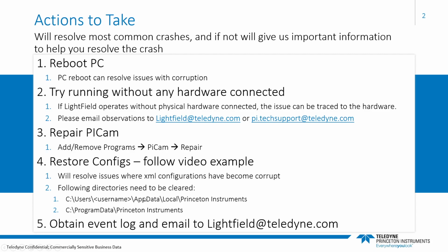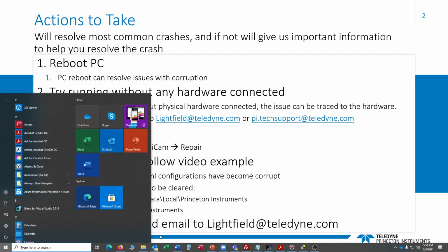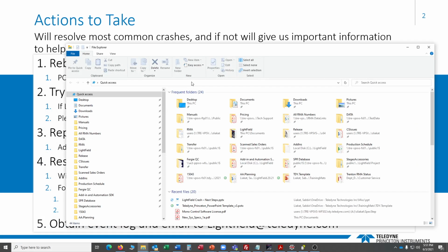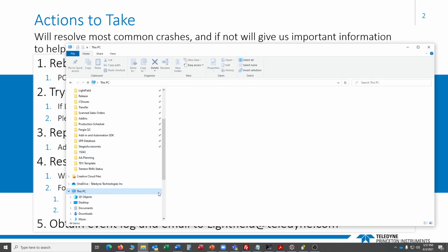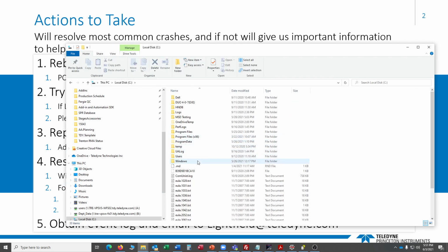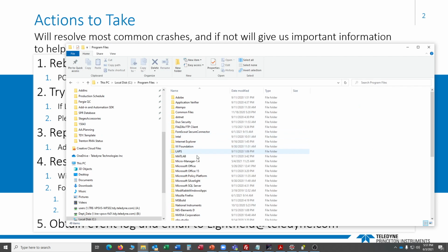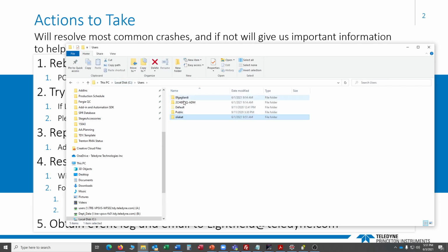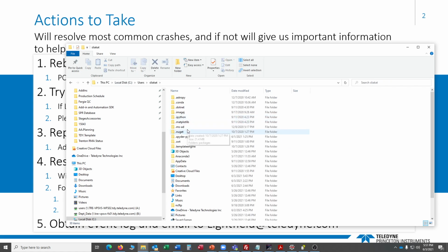And when I say cleared, I don't mean, well, you can delete all of them, but that's not recommended. So I'm going to show you what I would recommend. I'm going to open up a new Explorer, okay? I'm going to go to the first directory. Oh, sorry, the first one is Users. So I'm on this user right now, Leacat, okay?